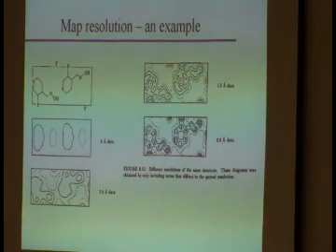if you have a good protein crystal, you may well get something that is 2 angstrom or better resolution, okay? Here's a 2.5 angstrom data set. Once again, if I knew nothing about what this material looked like, I wouldn't like that one, okay? Quite honestly, I'm sorry, but yeah, there's some blob here and there's something extending somewhere, but if I knew nothing, I wouldn't be comfortable putting atoms into that map. I know that molecule. Could I put that molecule in here? If I knew exactly what the molecule looks like?